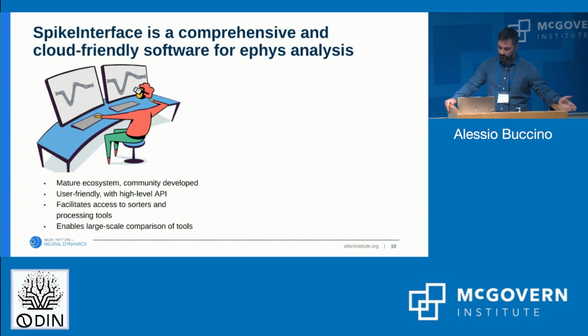It's heavily community developed. It's user-friendly with its high-level API, making approaching this complex analysis very easy. You can access multiple sorters and the latest state-of-the-art processing tools, and it also enables large-scale comparison of these tools.